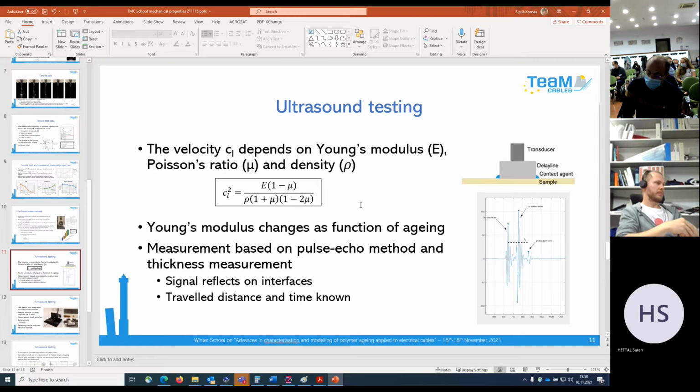Okay. And if it's more, is it a problem for the measurement or not especially? If you have 2, 3, 4 millimeter, I don't know. You should have a sufficient amount of material. Currently, it's 1 millimeter. I can answer. It doesn't matter if it's small. It can be even up to centimeters. That's okay, as long as you know the thickness.